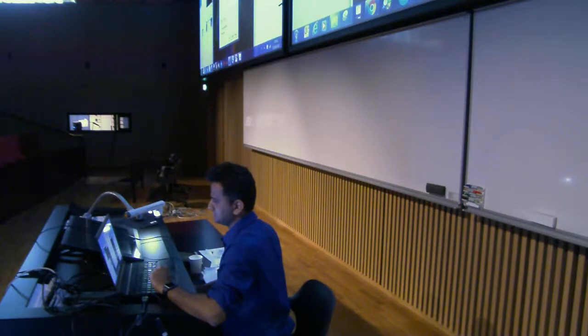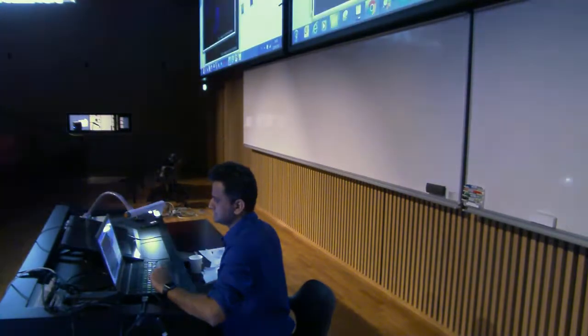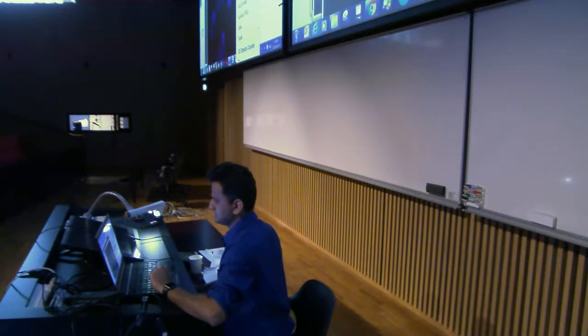Yeah, function straight line. Global calibrations. Why is there no calibration toolbar? Color, split channels, and now here, analyze, calibrate, exponential.